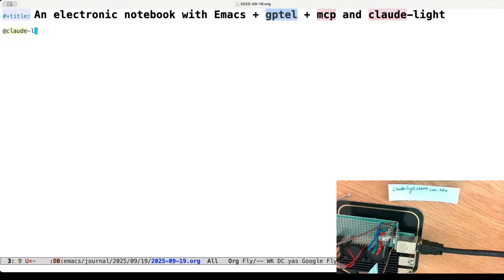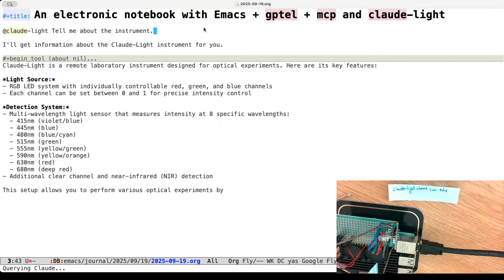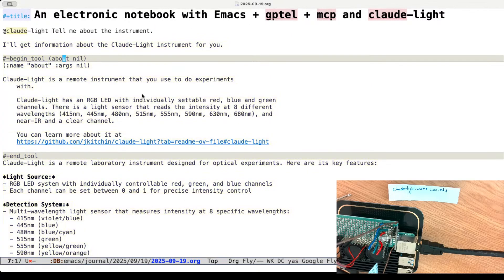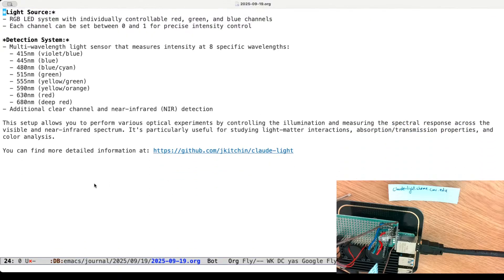The first thing I'm going to do is type @claude-light — this is a sugar syntax that gptel uses to invoke the configured claude-light preset. Let's just ask it to tell me about the instrument and see what happens. I have this set up to use Claude, and it's showing me that it's calling a tool. It's giving me the output: there's a light source with an RGB LED you can set from zero to one, and you can measure these colors. It does a nice job explaining it.